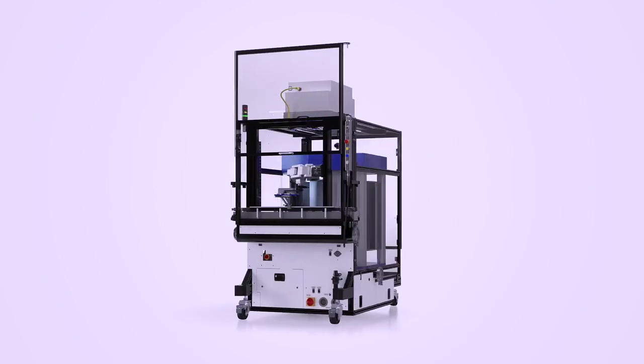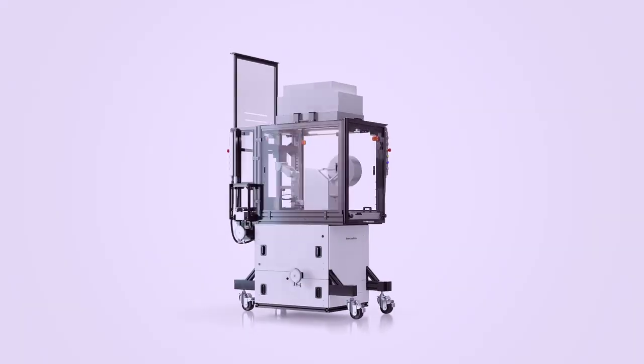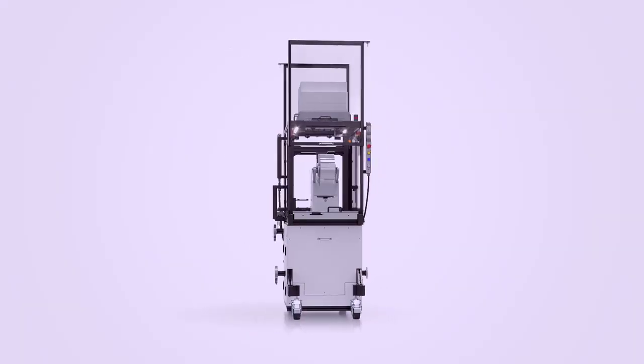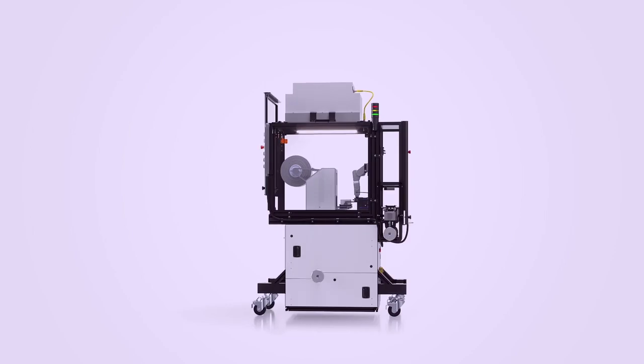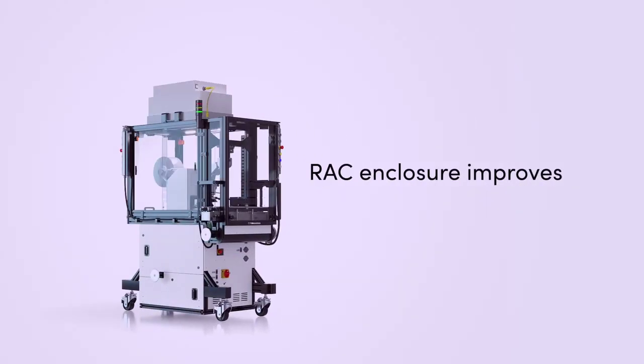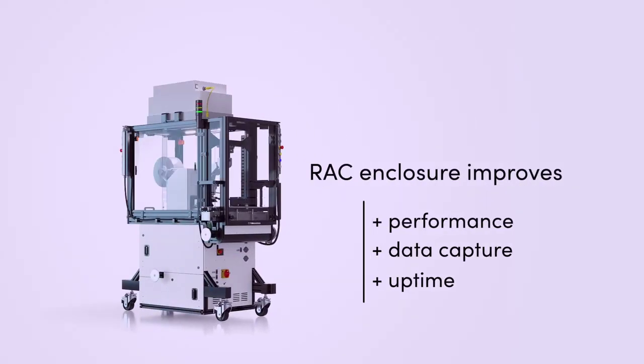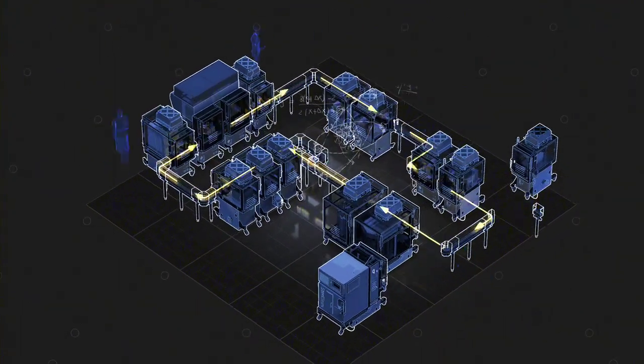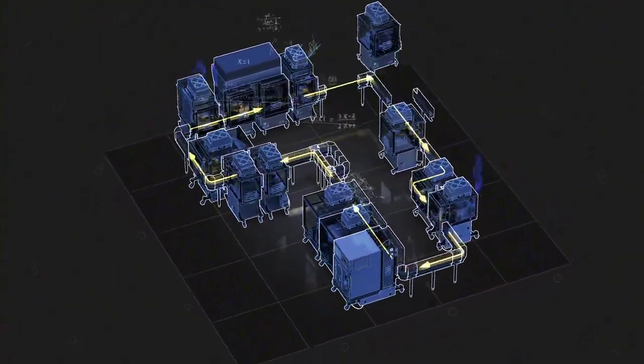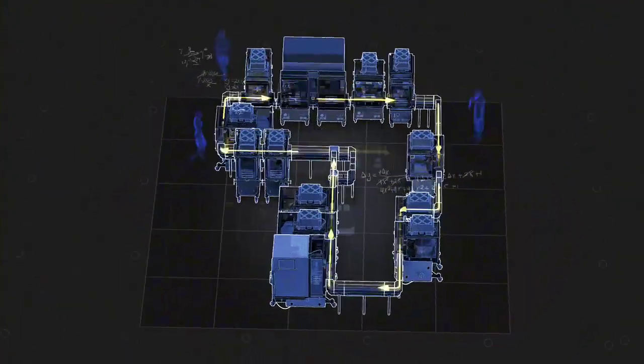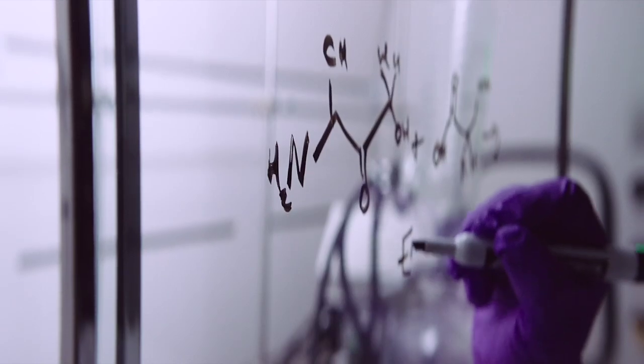Reconfigurable automation carts are the building blocks of a truly modular automation system. Our standardized device enclosures improve performance, data capture, and uptime for lab equipment so that your lab can focus on designing groundbreaking experiments.